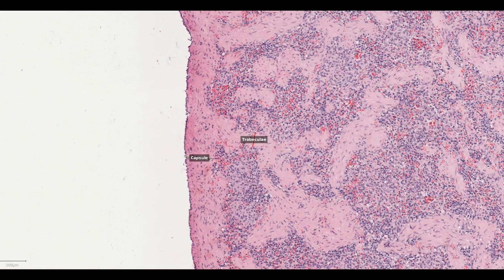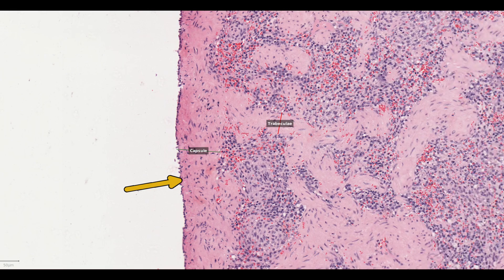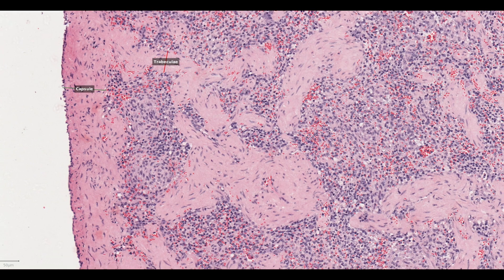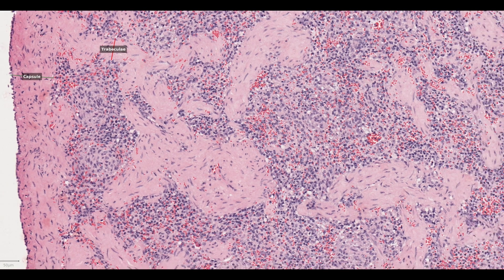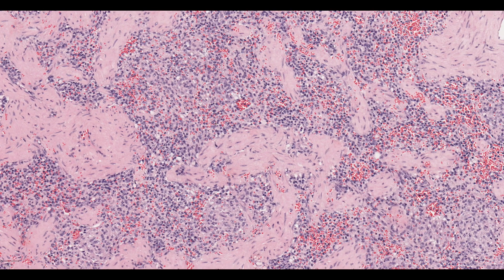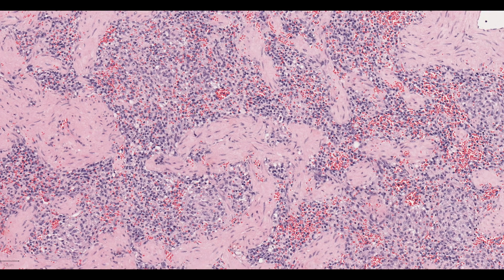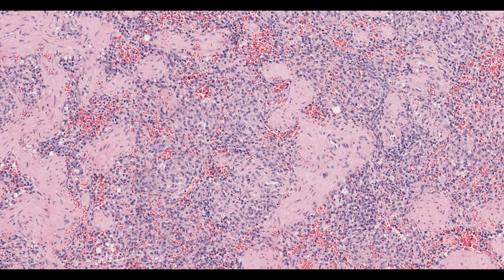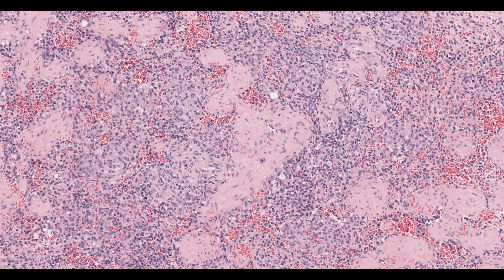Aside from the red and white pulp, the spleen has a few structural elements. It's surrounded by a thick fibrous capsule from which trabeculia of smooth muscle extend into the parenchyma. These smooth muscle trabeculia are particularly important in horses and dogs, which use the spleen as a reserve tank of red blood cells. When these species exercise, the smooth muscle trabeculia contract and squeeze all the reserve cells from the red pulp into the circulation, where they can usefully deliver oxygen.